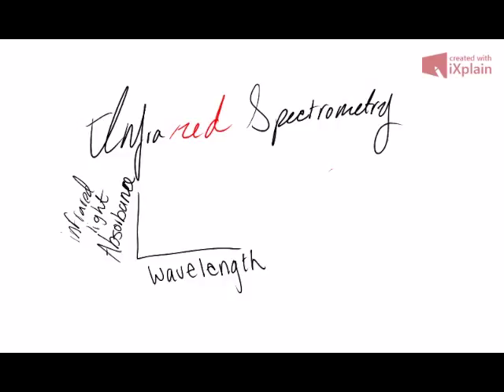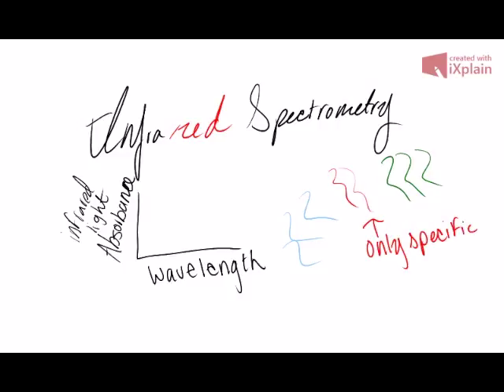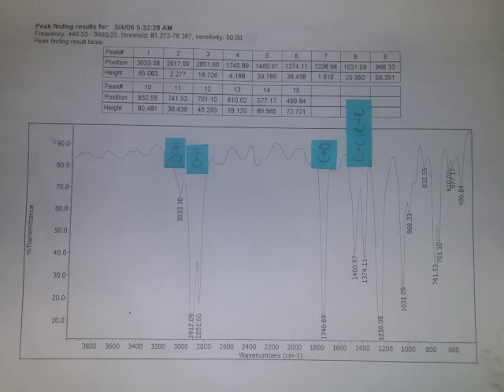These absorbances are resonant frequencies that match the vibrational frequency of the molecule. This means that the type of wavelength that is absorbed determines what the substance consists of, and the types of bonds that are present, as a certain type of bond absorbs specific types of wavelengths. In the experimental application, the infrared spectrum was created. Analysis of the infrared spectrum revealed peaks at the interaction of the benzyl ring, the C double bond O bonds, and the CH and OH bonds that are present in the benzyl acetate.